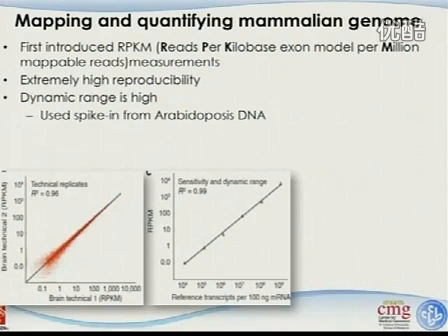Okay. So what they found out is this is based on 100 nanogram of messenger RNA, and this is the number of reference transcripts they put into the cells. You can see this from 10 power 4 to 10 power 9. I'm going to use this 10 power 9, and this is the RPKM value they have identified. And you can see that it's a very, very nice linear phase. The more RNA transcripts they put in, because this is spike-in, so they know the answers they put in, the more signal they get. It's a very, very nice linear phase.